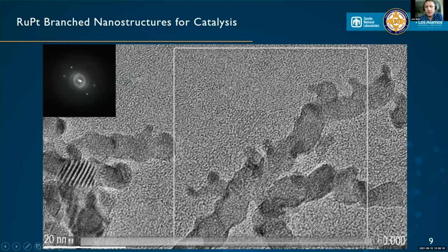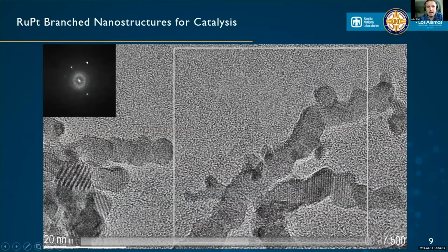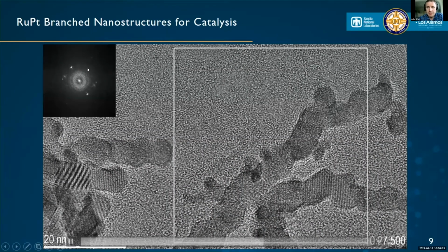We can also use some code written by Ben to pull out the FFT and create an FFT video. But I think the key thing here is that these cameras have just got so beautiful that rather than zooming in on your one node that you know is on zone and trying to capture that without drift and keep it in the center of the view, you can take this wide field of view and then you can search around within it and find the thing that's doing the business. The other thing is now we can start to get statistically relevant information. So you can look at multiple nodes, match behavior, and you can say that we saw a dozen of these things happening, so we're certain that this is the effect that we're after.